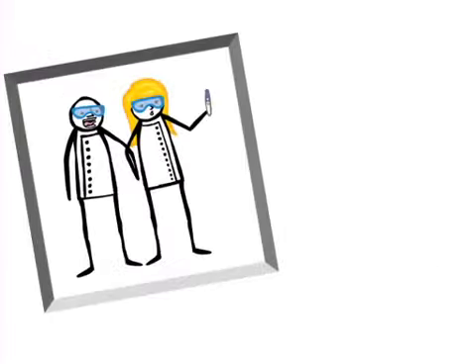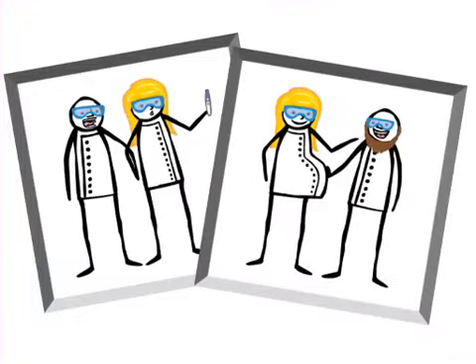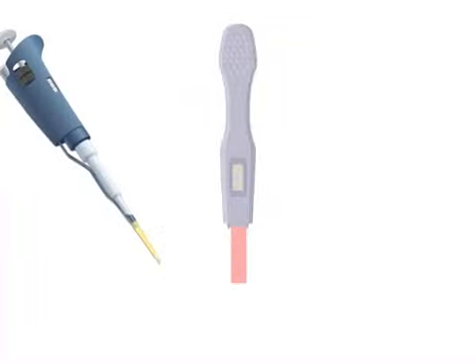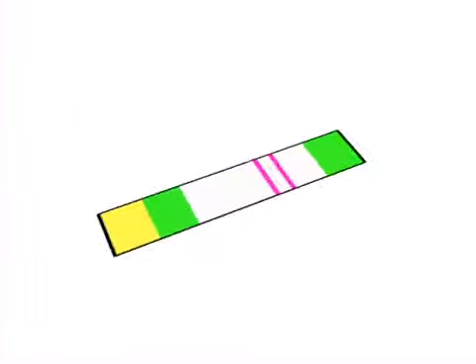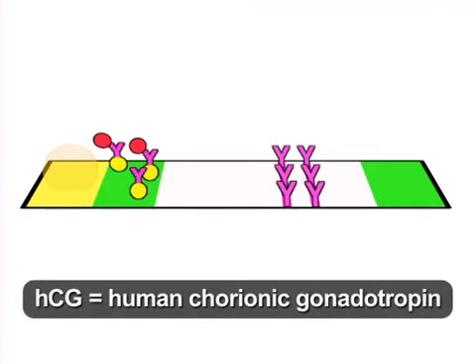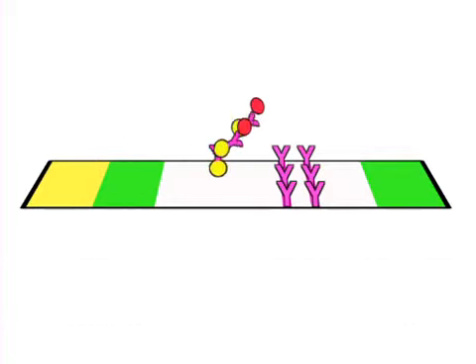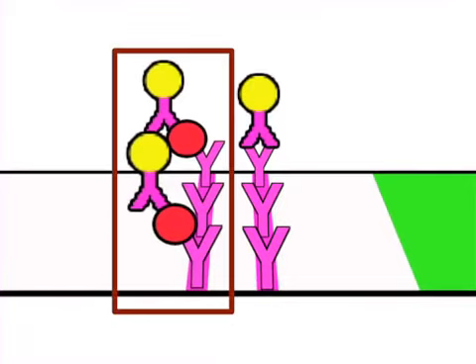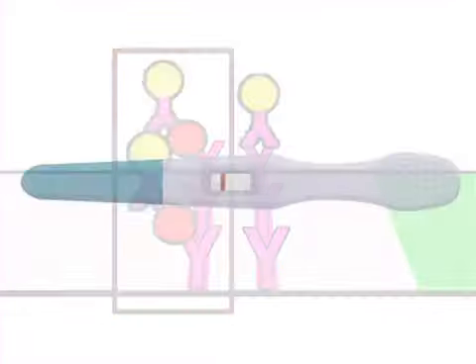The over-the-counter pregnancy test is one type of sandwich ELISA. When the potentially pregnant woman's urine is added to the test, enzyme-linked primary antibodies attached to the test will bind the pregnancy hormone HCG if it's present. If the woman is pregnant, a substrate enzyme reaction will occur when the primary antibodies are recognized by substrate-bound secondary antibodies at the test site, and a colored line will appear.